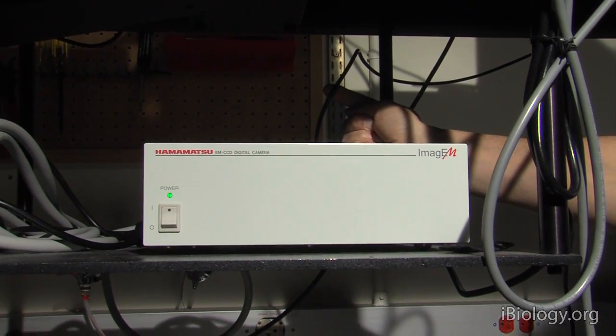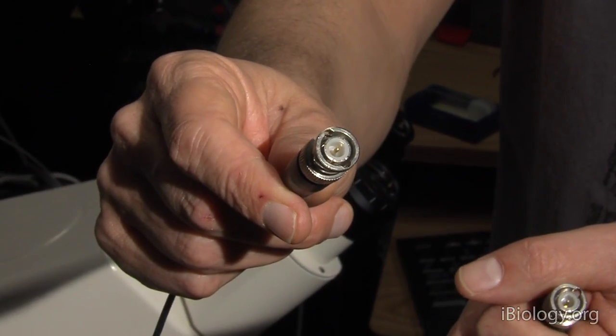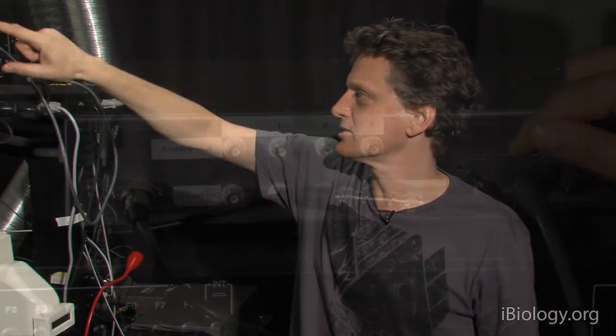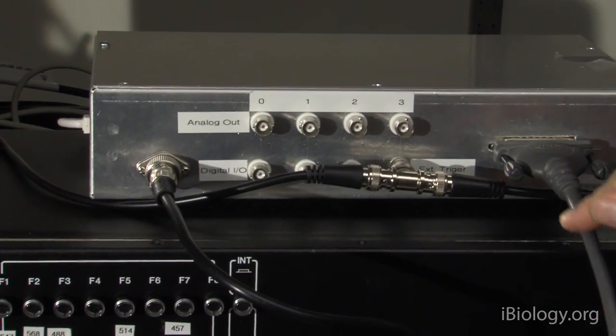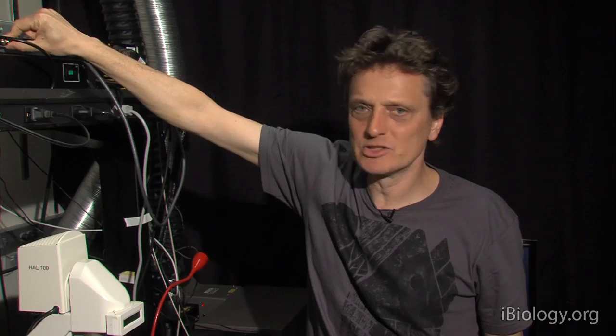So we'll now go through these different components and show how they are linked to each other through electrical signals. So first we go to the camera. The camera has a controller. On the back of that controller is a BNC cable. That BNC cable runs to this box here. This device has a little microcontroller in it that is reading out the state of this input continuously.